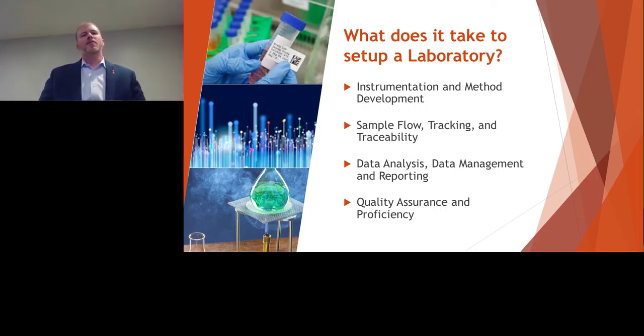So the four main objectives within the laboratory setup are looking at your instrumentation and the method development, and then also sample flow as samples come in, how you track them, and that big word, traceability. And then once you have your samples and you run your analysis, there's the data portion, data management, and also reporting out to your clients. And then the very important part of all analytical labs is your quality assurance and proficiencies.